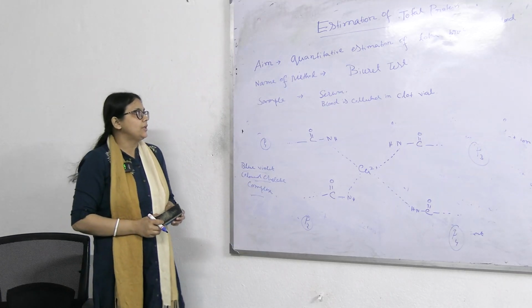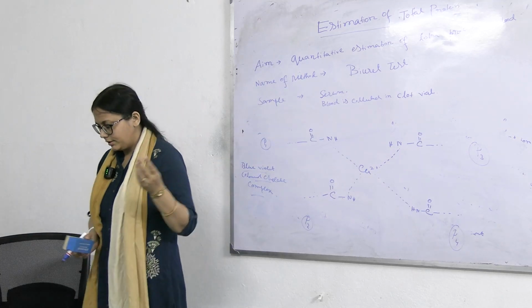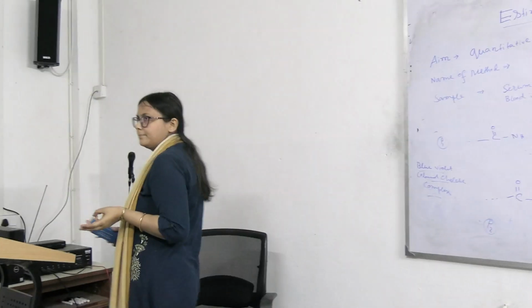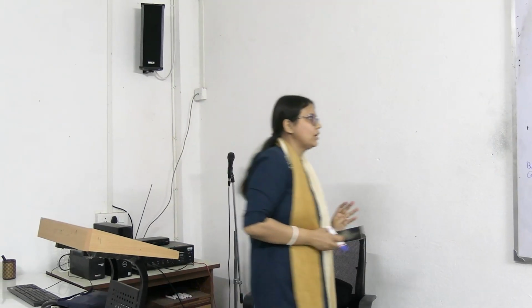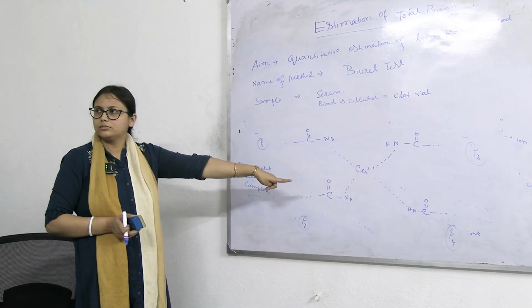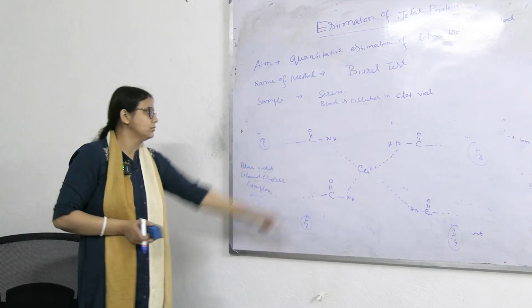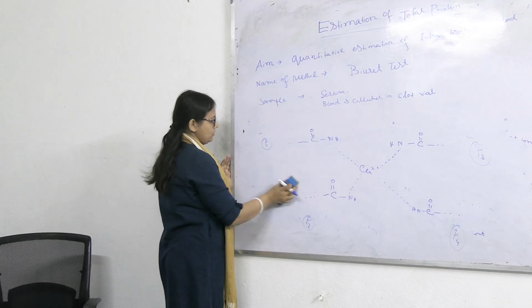So we have completed the name of the method, then the sample, then the principle, then the reagent. Now coming to the procedure. This is done, and this has to be drawn in the practical notebook.